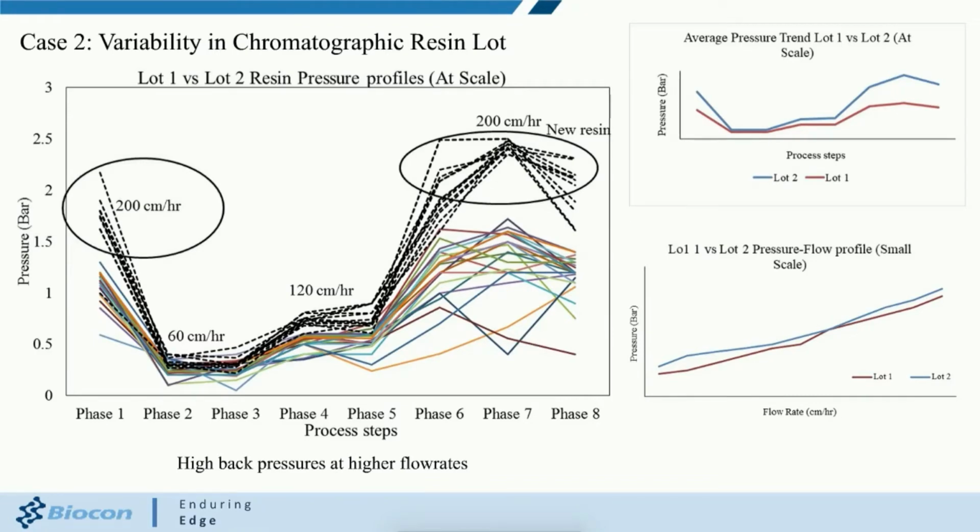Coming to the chromatographic resin. In the purification process, you know that downstream typically works in two ways. One is filtration, and the second is chromatography. Both play a very significant role in removing impurities. We talked about the filter, so the other one is the chromatographic resin.